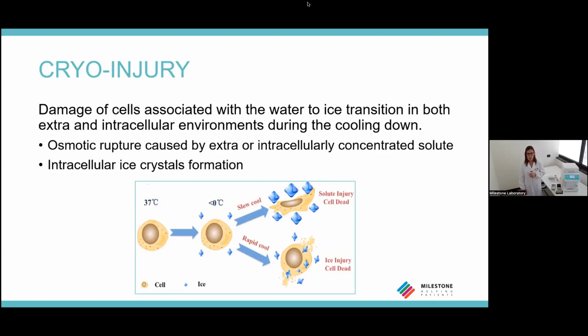The other problem is the ice crystal formation inside the cell. As you know, the solid state of water is bigger than the liquid state. In fact, when water freezes, it organizes its molecules in a crystal that is bigger in volume with respect to the liquid water.